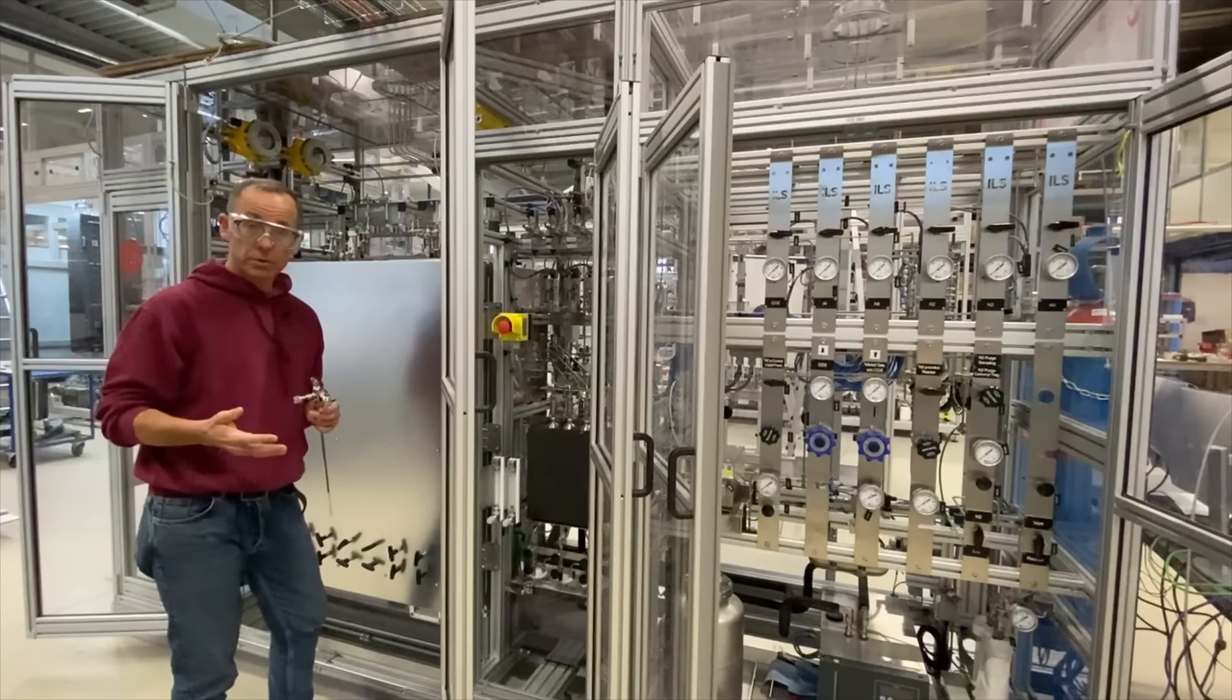Here you can see we have the cold separators with purged boxes where we can remove the aqueous or alcohol components that are typically formed in a Fischer-Tropsch synthesis.